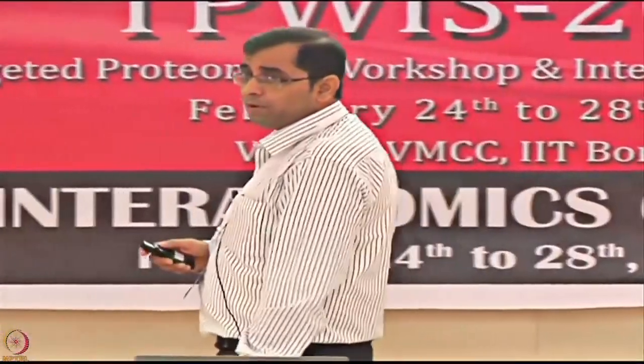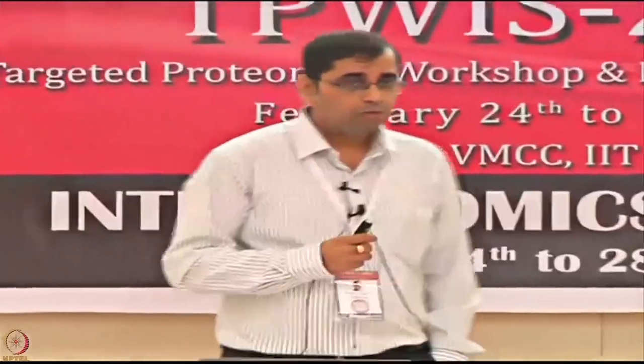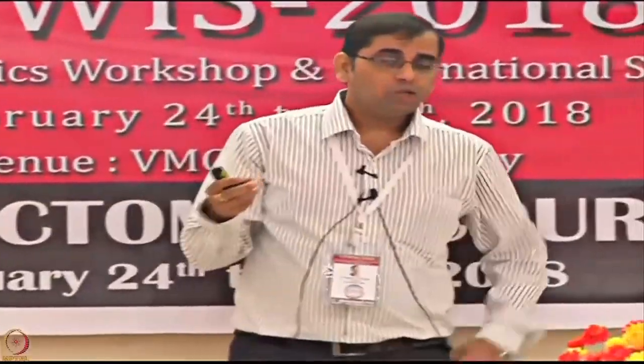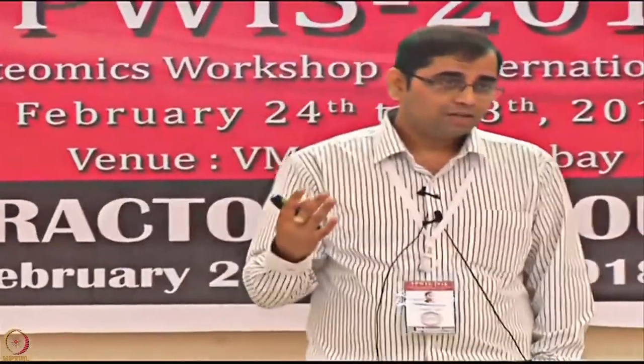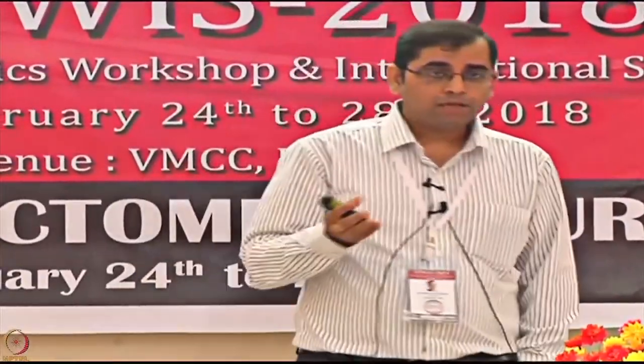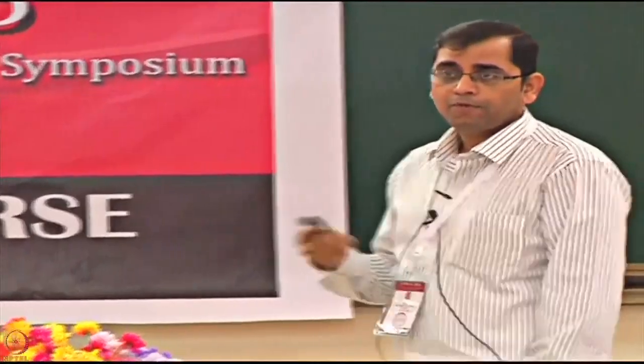Of course, we are talking in this course about high throughput platforms. I'm sure with Josh's talk, you are pretty much convinced that if you have chips which can screen 10,000 proteins, you are going to get very high quality data. You are reducing your time, you are reducing the cost, and so much variation which comes by doing too many experiments, if you had 1,000 proteins on one chip versus 10,000 on one chip. The same thing is applicable here on the SPR-based platforms, where you are doing a maximum of only 4 interactions on the Biacore kind of platform, versus if you can do thousands on a different platform. That's where the concept of SPR imaging became very powerful, with the hope that we can build a platform which can do high throughput interaction studies using the same principle we have used for SPR.